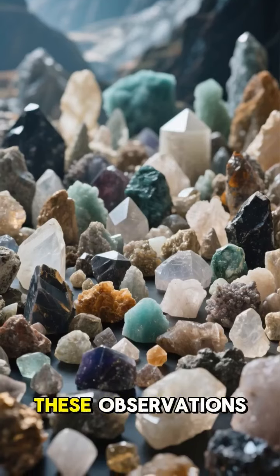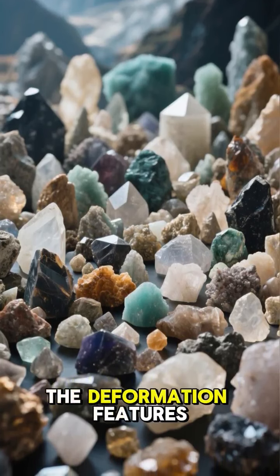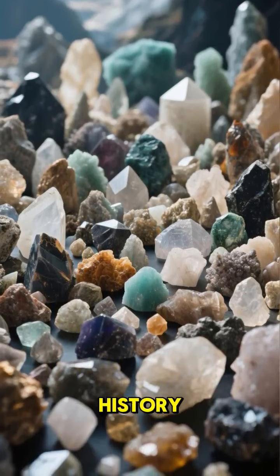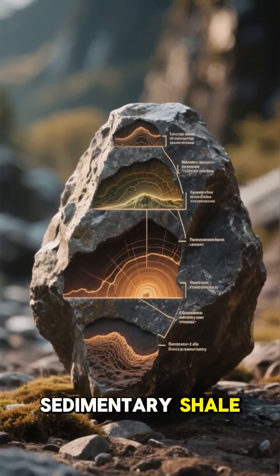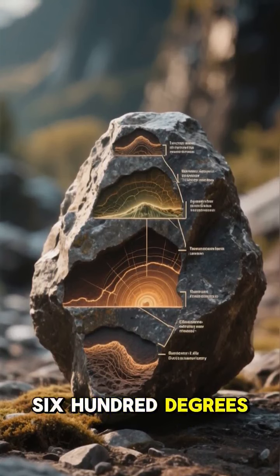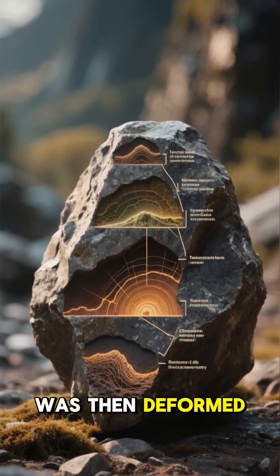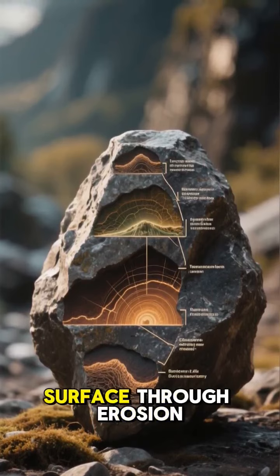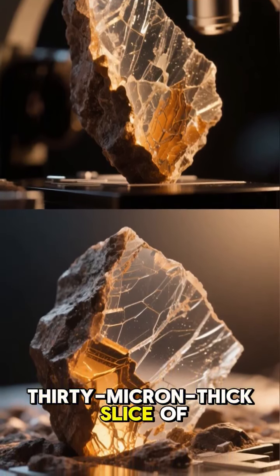By combining all these observations, the mineral assemblage, the textures, the deformation features, we can reconstruct an entire geological history. We can say, this rock started as a sedimentary shale, was buried during continental collision, heated up to 600 degrees Celsius at a depth of 20 kilometers, was then deformed and sheared as the mountains rose, and finally was brought back to the surface through erosion, all of that from a single 30-micron thick slice of rock.